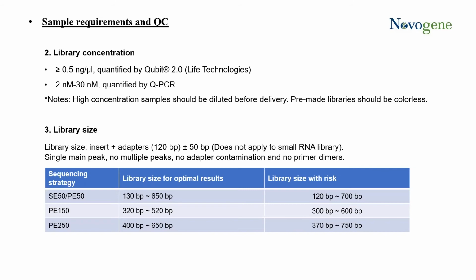The inserts, a couple of things that we need to pay attention to right off the bat is size. Size incorporation of your insert can lead to skewed data output to one size or another. It can lead to lessened data output. It can lead to bad quality data output if we do not consider the inserts themselves.